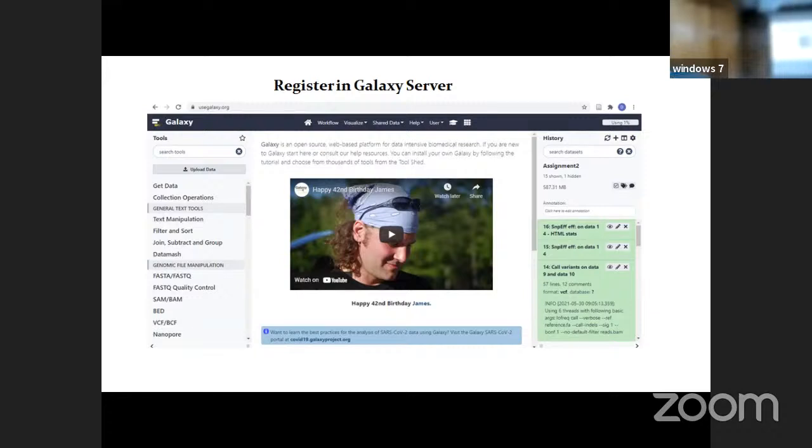You can ask me why I am not saying to use this. You can use this, but uploading 100 GB of data is not that easy. Even for 2 GB data upload, it will break multiple times. So it is not that easy. Point number two, when you are analyzing with this, you don't have that much flexibility. First is uploading. Next, point number three, if you are working with your original data, you won't like to upload it and give it to somebody.